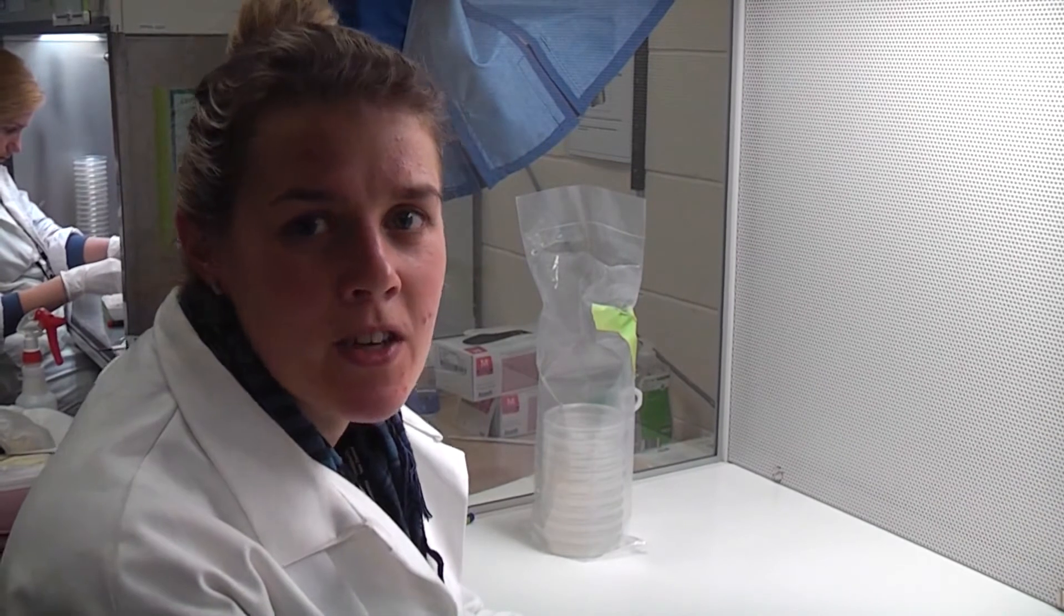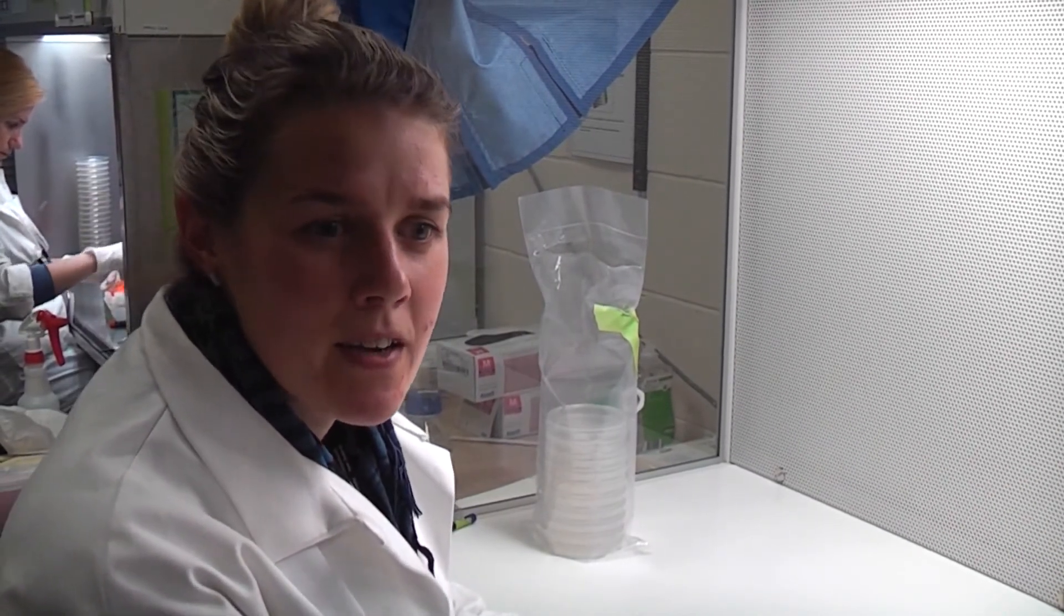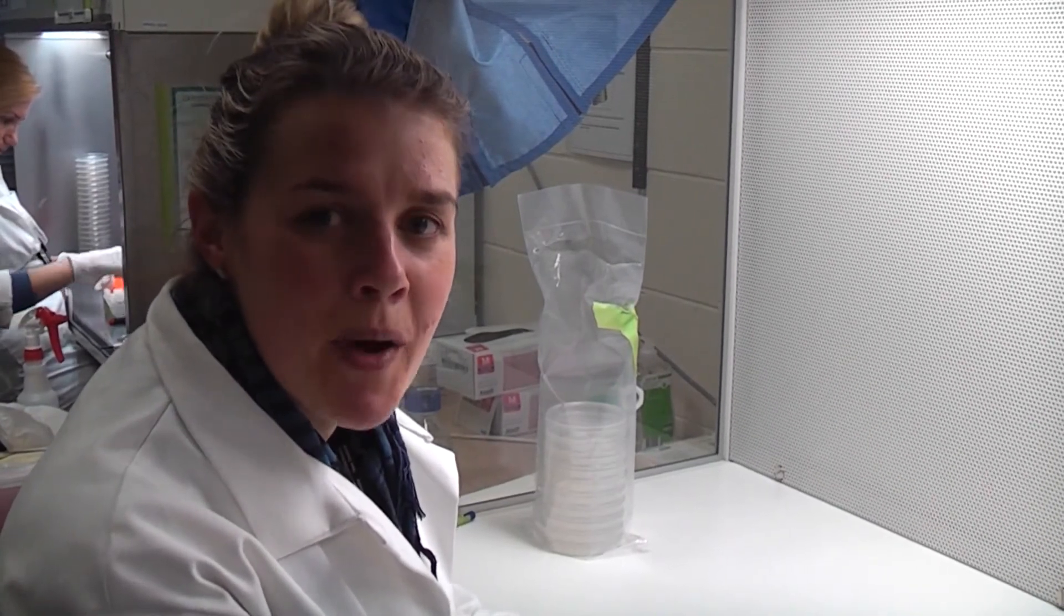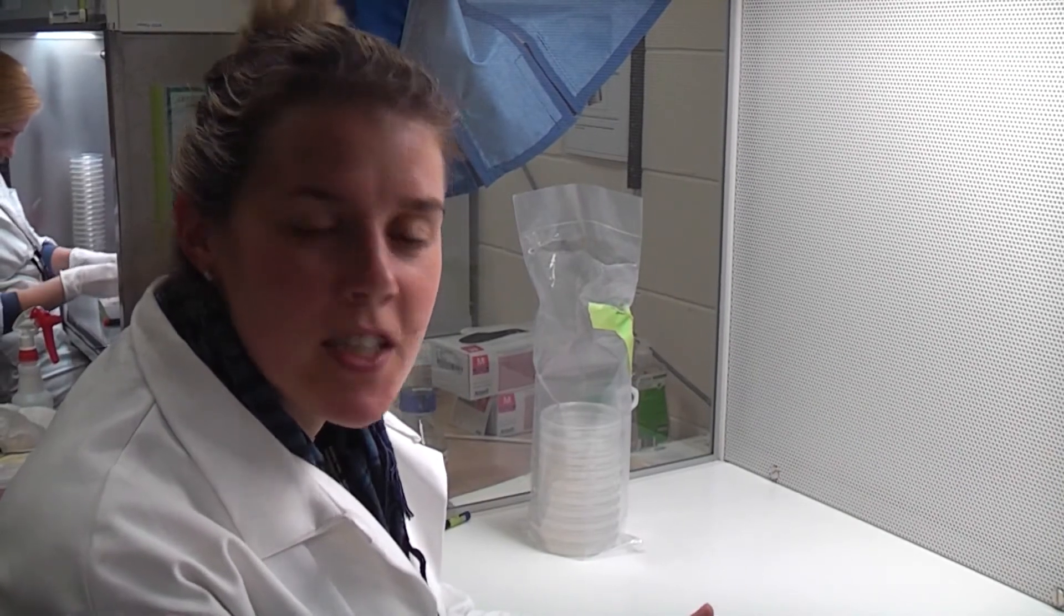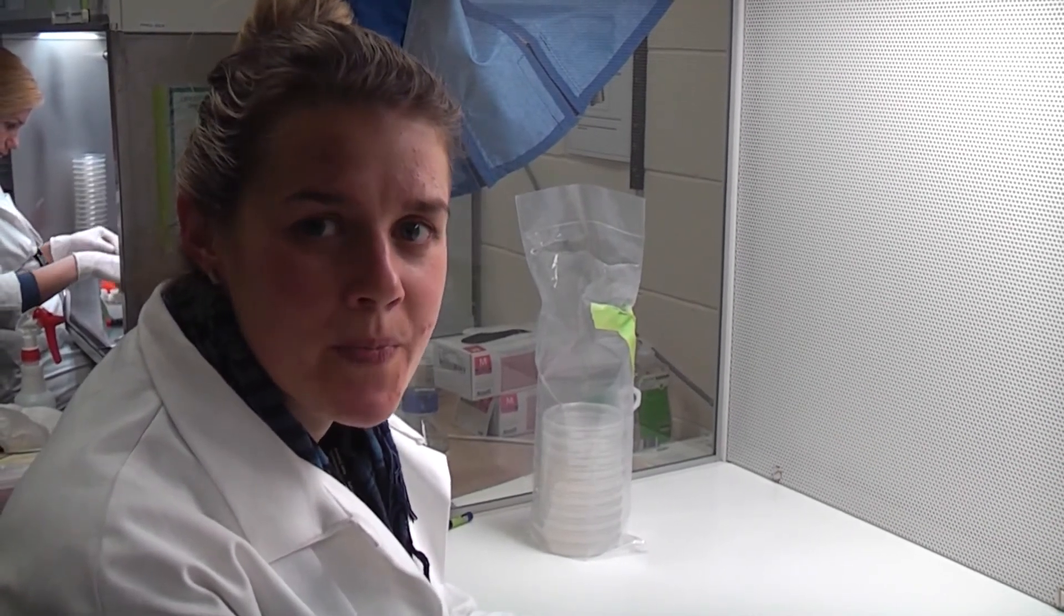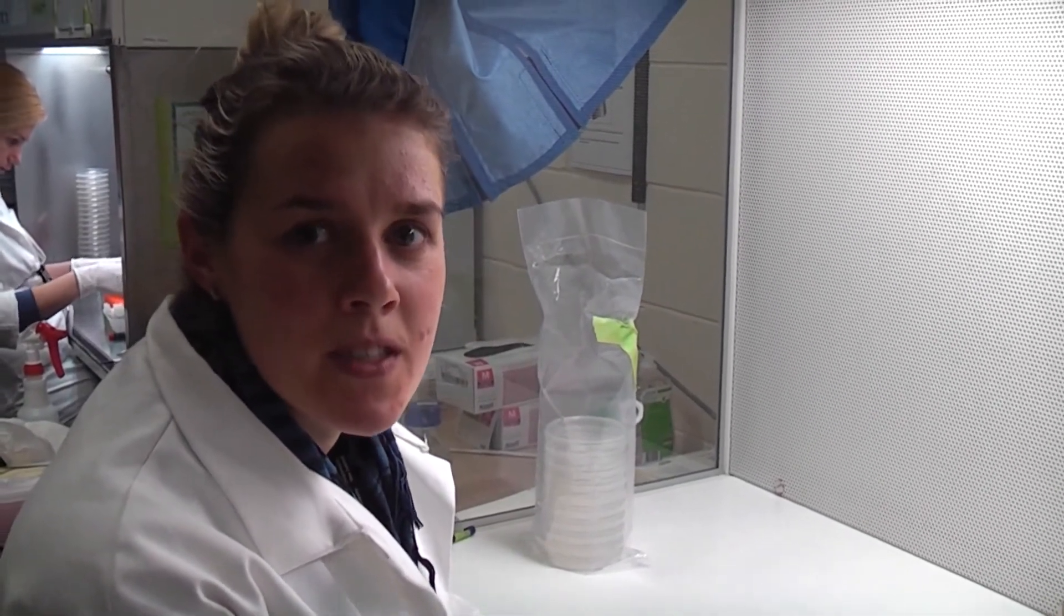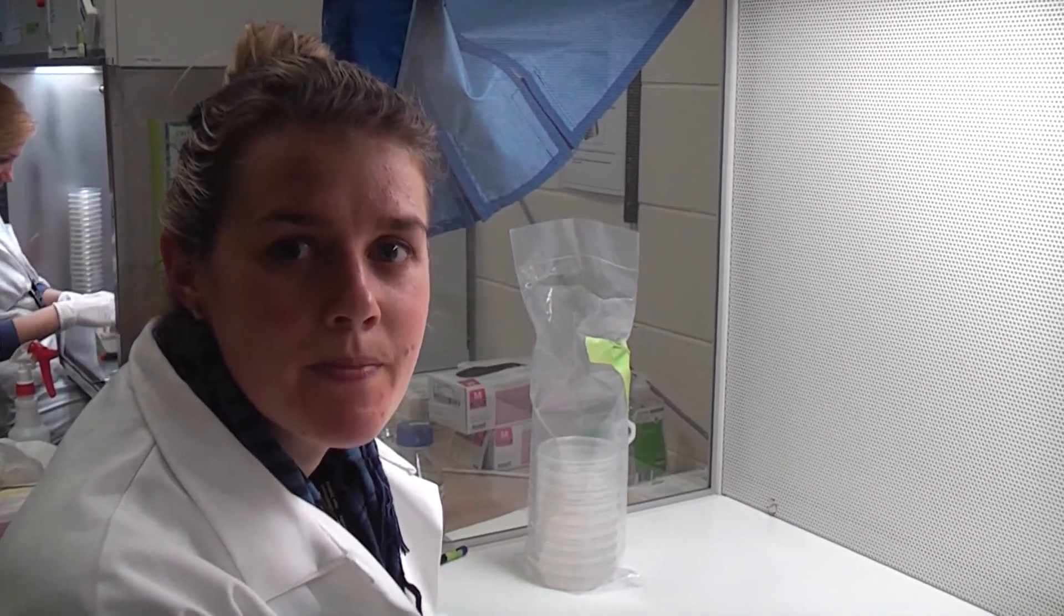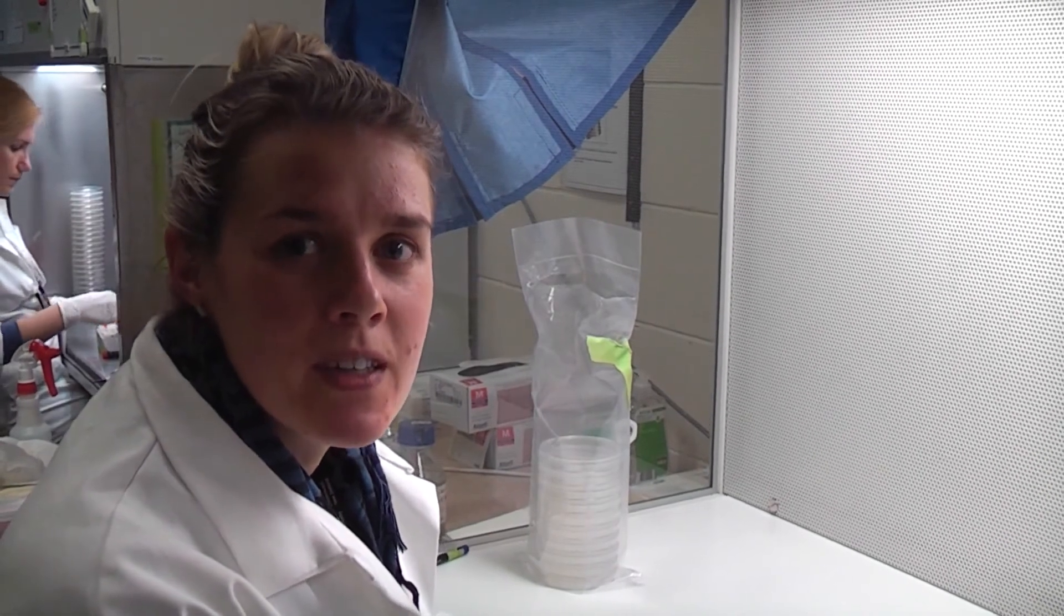So they've been inoculated with TA1 and this trial was sown in the autumn this year and I've been digging up white clover plants every two months and looking to see how much TA1 is in the nodules. I'm looking to see how long TA1 is present in the nodules of the white clover plants. Okay, so it's nodule occupancy of TA1. That's what you're looking for? Yeah, that's what I'm looking for.